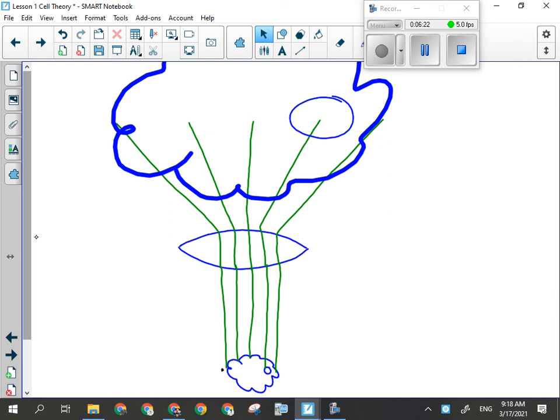So if I was looking at a letter E, like we're going to do tomorrow, I'll put it in right side up, so it looks like a letter E. I put it in the microscope and it's going to look the other way through the microscope, because going through two lenses will cause it to flip over. So the path of light gets altered. That's basically all you need to know. It's called refraction. Understand that that's what lenses do in order to magnify an image.